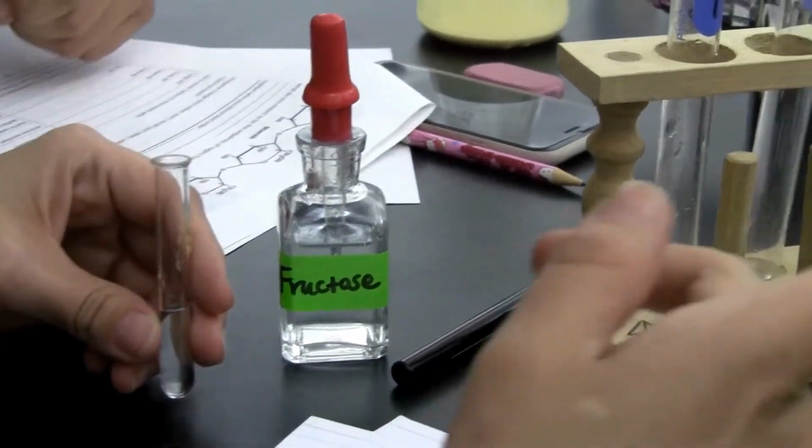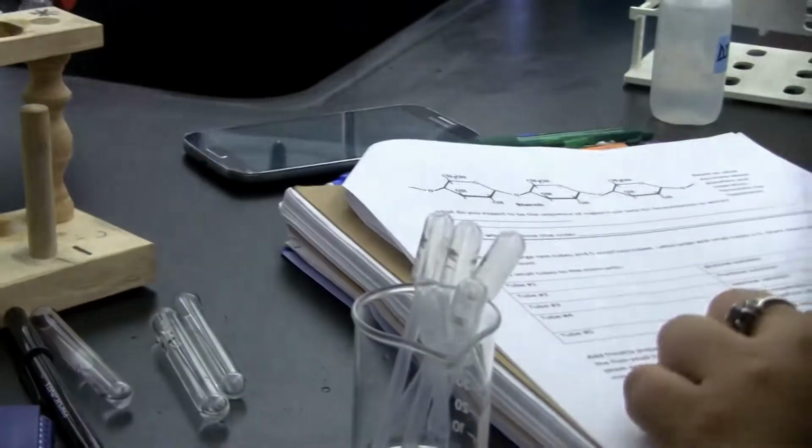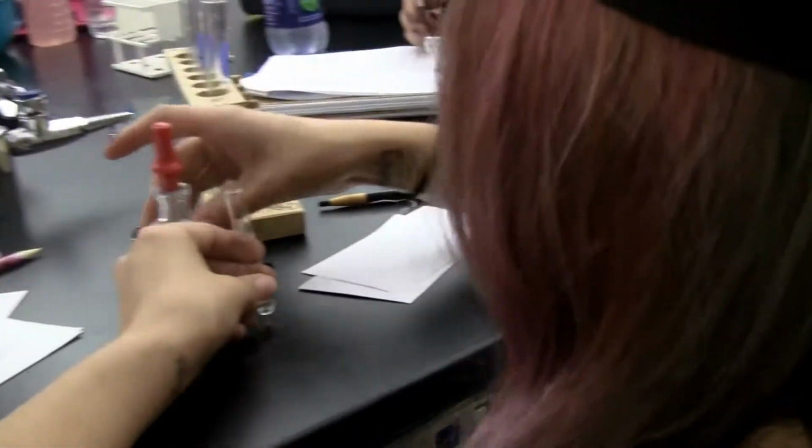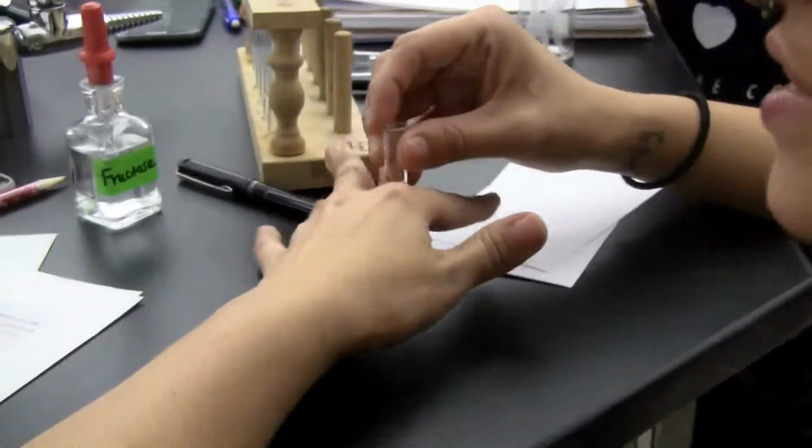So then we need to add yeast to that one? No, we can do that at the end. We can just keep adding these to prepare them, each of the 5. Okay, there's fructose. I'll hold the ones you're done with. Next one is going to be sucrose.